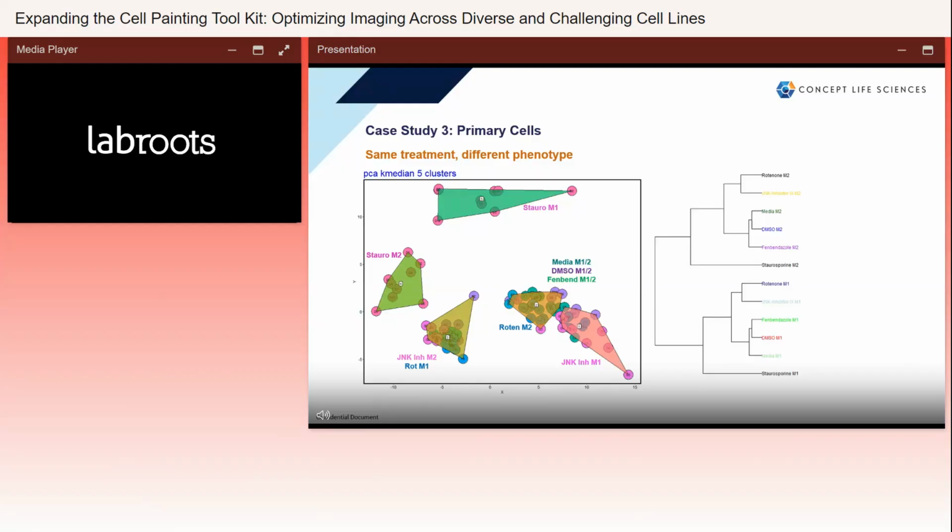The healthy phenotypes of these cells look different, and so did the dead and dying ones. Whether this is just to do with relative differences in autofluorescence or cell fragmentation that was left behind in the wells can't be determined here.